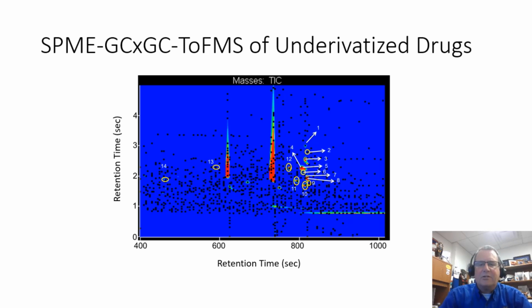into green chemistry. Now, one challenge that we have is it's not just a reaction that we're doing, but we do sample preparation, instrumental analysis, and then we're doing it over and over and over again. And we need to think about that as we think about trying to green it up and as we think about the assumptions that we make while we're doing that.